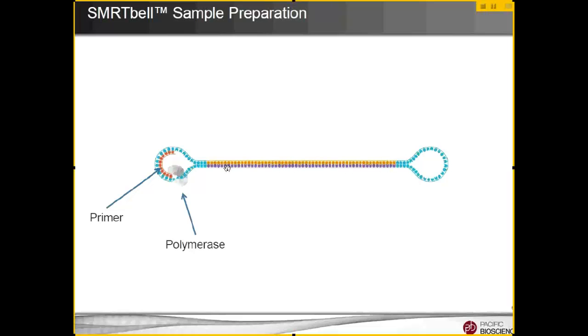So oftentimes, your first and last strand, especially if you're doing that circular consensus thing, will only be partial strands. They're working on trying to get something they call hot start, where as soon as the polymerase is initiated, very soon after we'll start sequencing here. That's something that they are working on.